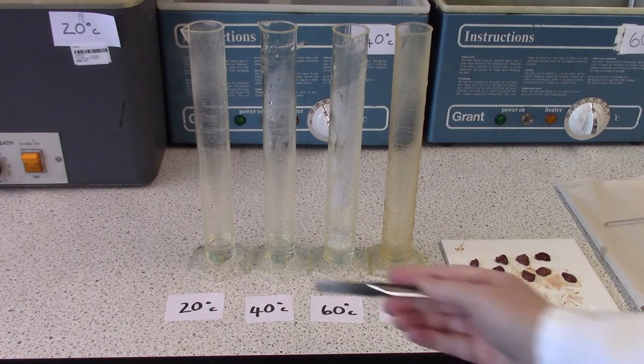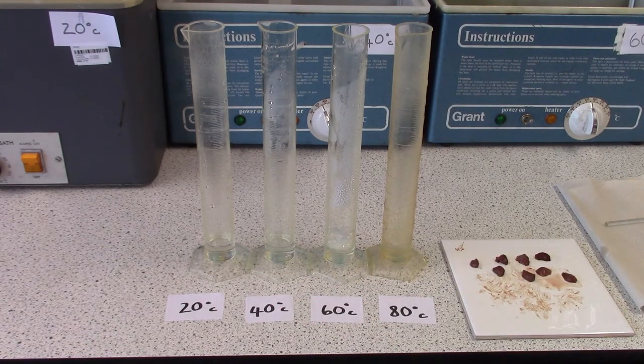We have 10 ml of hydrogen peroxide in each of these measuring cylinders that have been in the water baths for half an hour at 20, 40, 60 and 80 degrees.